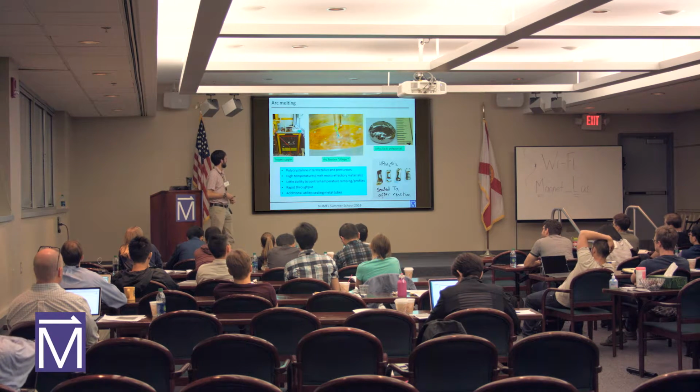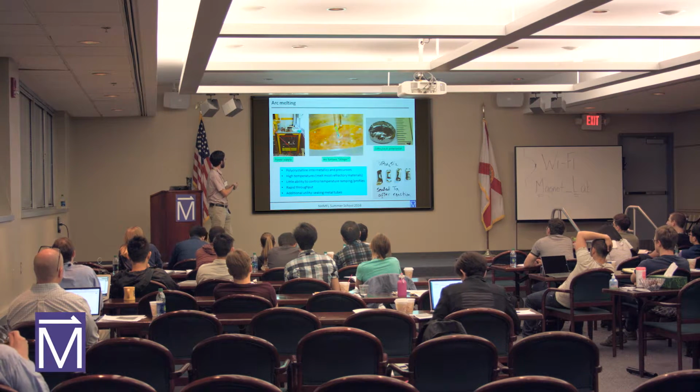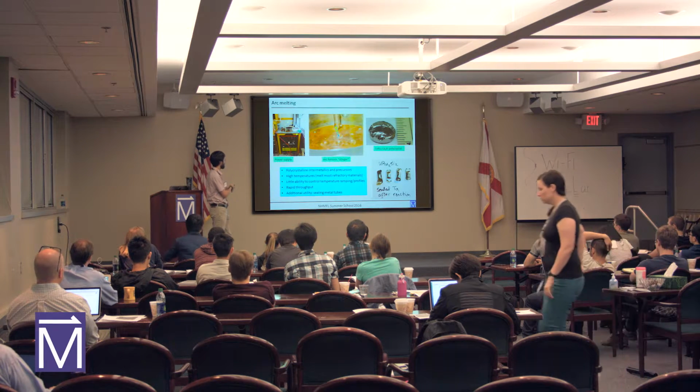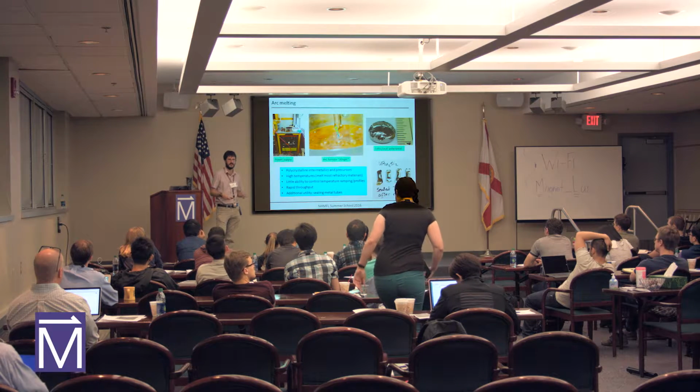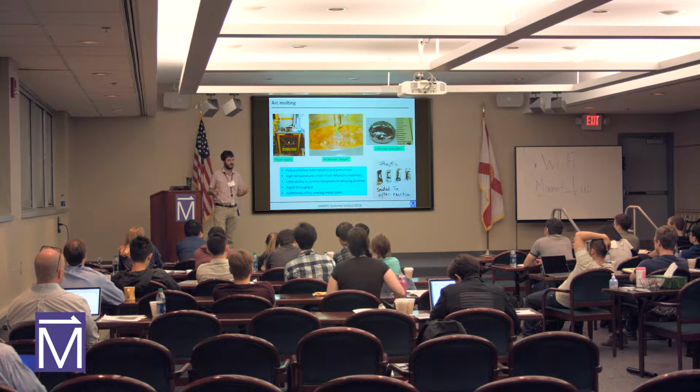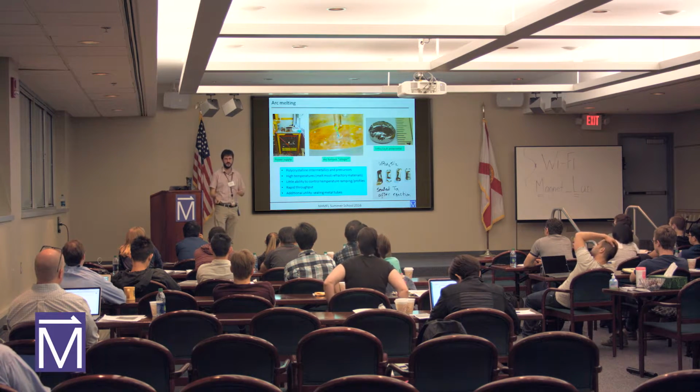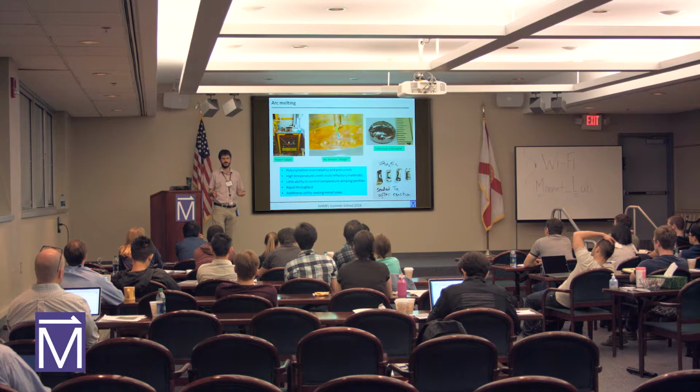Okay? So the idea here is that you might take your precursors and load it into this sample hearth. And then I don't show it here, but actually you bring a bell jar onto this, right? And then you can pump this thing out, and you can get a pretty good vacuum on it. If you want to have a fairly clean atmosphere, what you'll do is to refill it with argon, and then pump it and refill with argon and pump it, and so on and so forth. And sooner or later, you have a pretty clean environment in there.